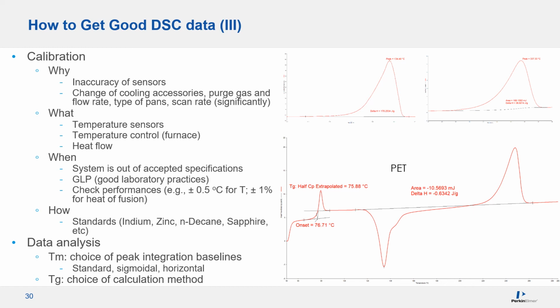Another example, which I have mentioned earlier, is the calculation of crystallinity using the melting peak. Make sure you subtract the cold crystallization. This PET sample is sort of unique because the baseline is actually a straight line between Tg and the melt. So you can just do crystallinity analysis in one action. This pretty much summarizes the DSC topics, and we are switching gears to TGA.